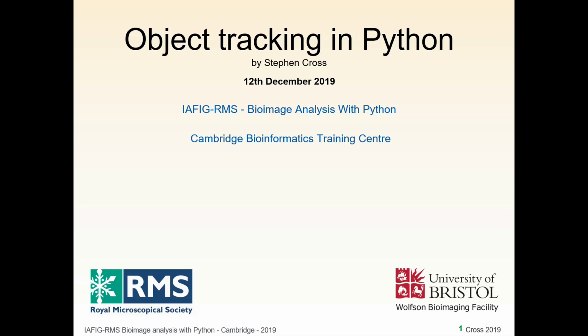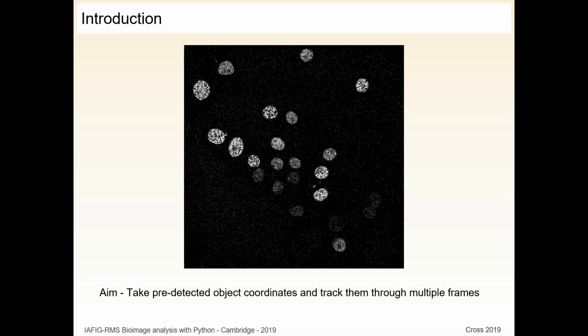At this point, it's also worth going to that GitHub either way, just so that you can download the Jupyter Notebook and this PowerPoint so you can go along at your own pace.